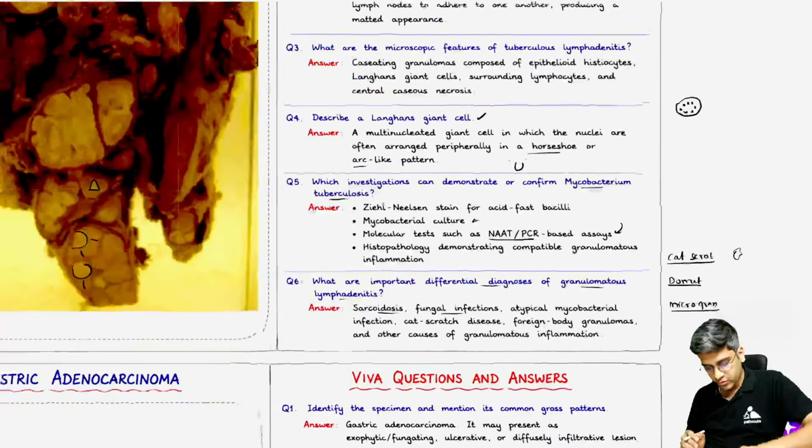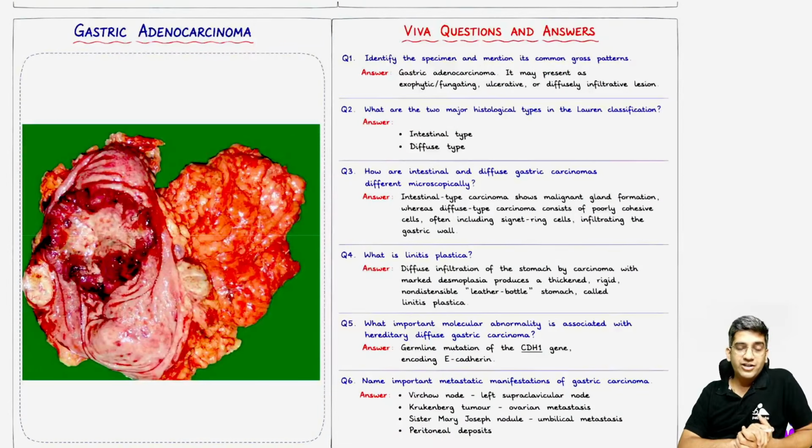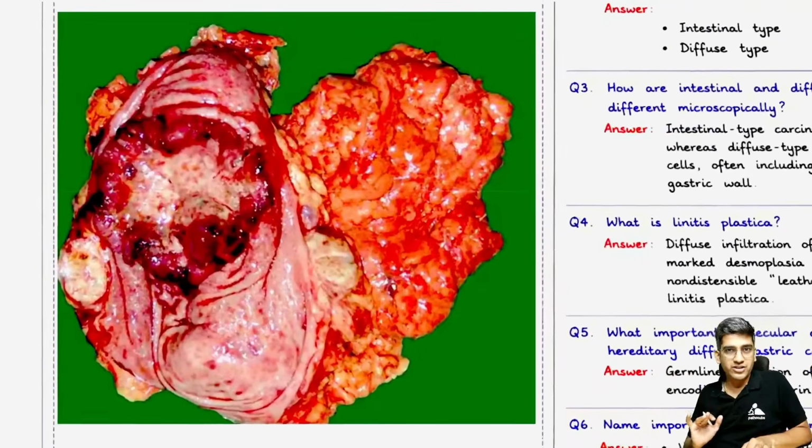Perfect. Those are a few questions which can come in a TB specimen. But trust me, tuberculosis is something which is very difficult to handle because the discussion can go in any which way whatsoever, right? Perfect. The third thing, I have taken a fresh specimen for the discussion.